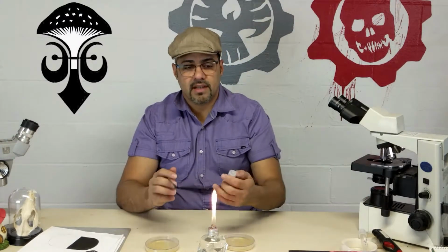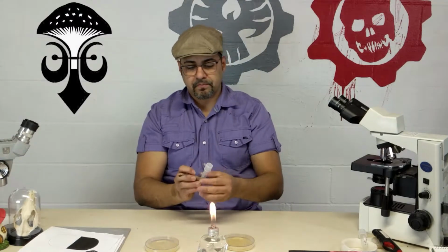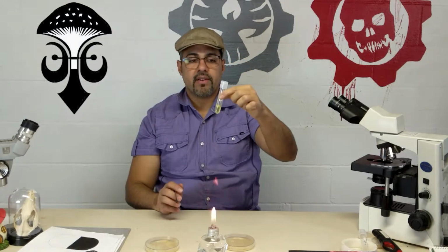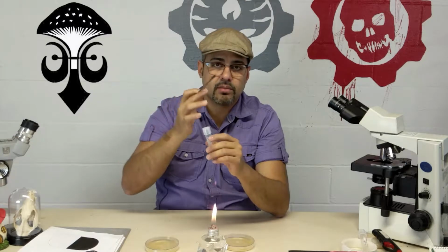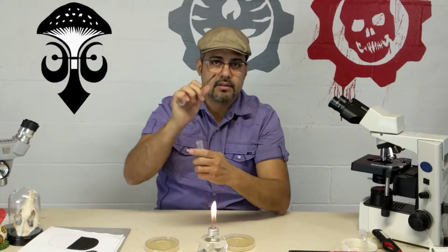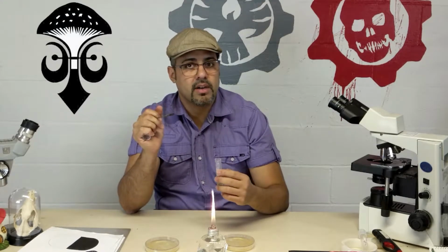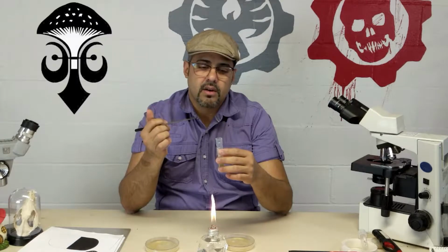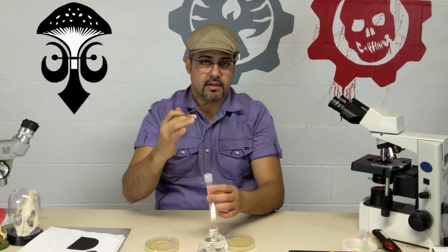I have a couple of examples that I'm going to show you later on. But for example, let's say that we're transferring from a tube. Very important that with the pinky, normally you take the cap, right? Now, this tube is plastic, so I cannot flame it too much because then I'm going to melt it. Normally these tubes in the lab, we use glass. So pretty much you take it with your pinky, right?